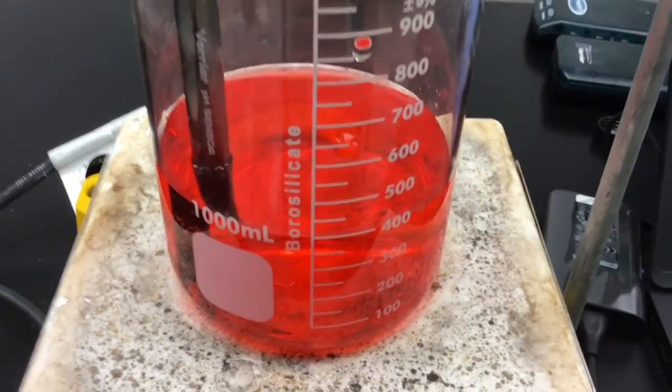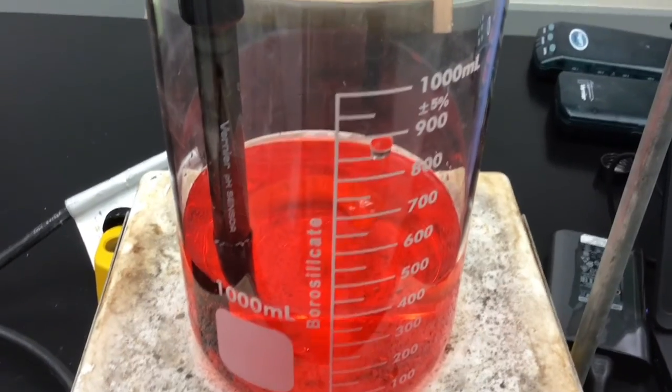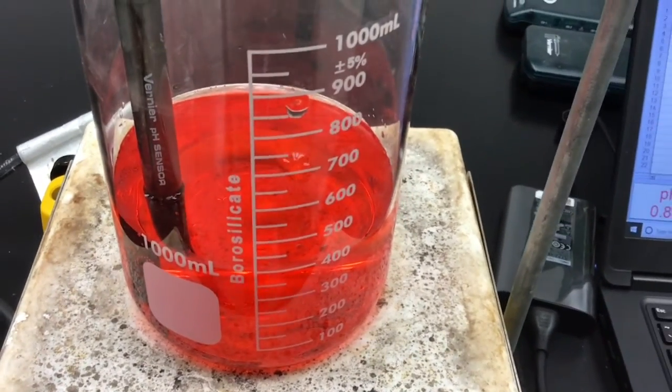And then, consequently, what should I see as far as my colors are concerned if I'm adding it in at a constant rate and I am starting here at a red color? I'll give you a minute to think about that.